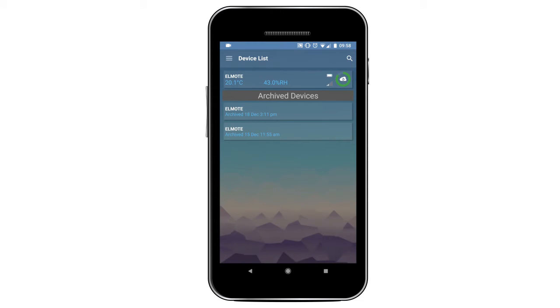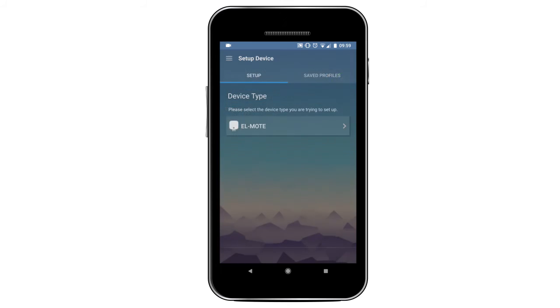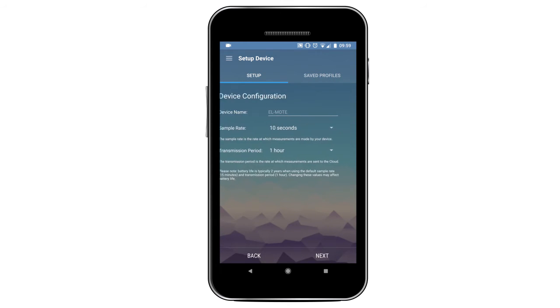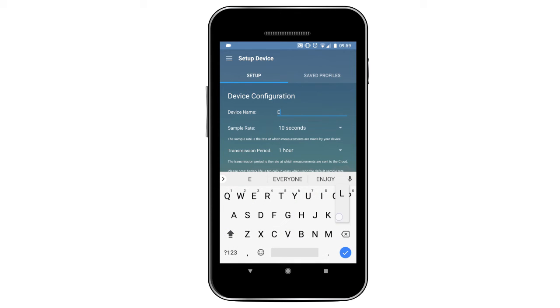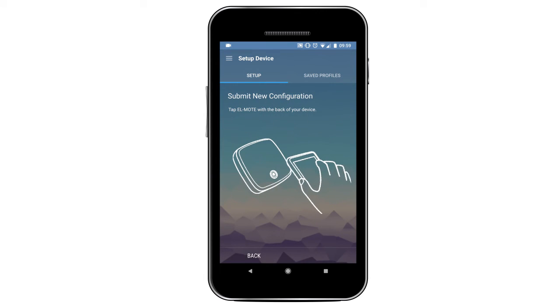Need to set up a second device? Use NFC for a quick and seamless setup. Go to Setup Device, choose the NFC option and your saved profile. Next, name your device and then hold the back of your phone over the NFC chip on the device to connect.